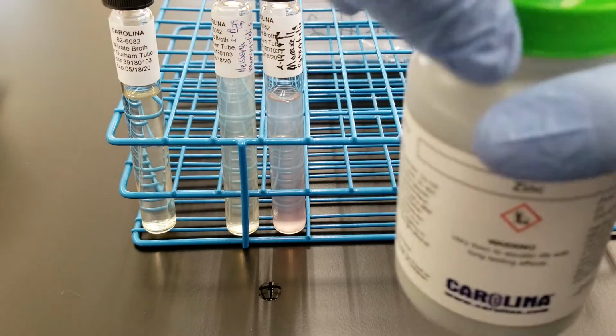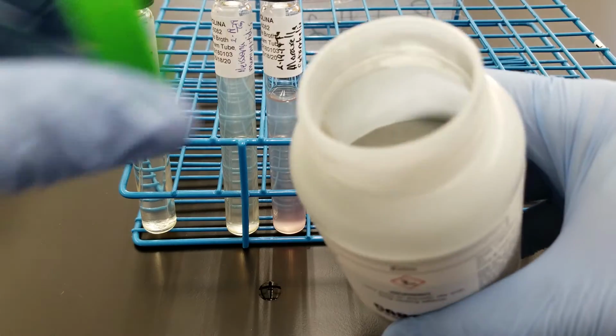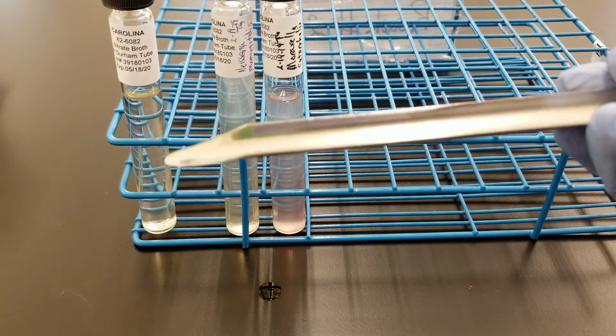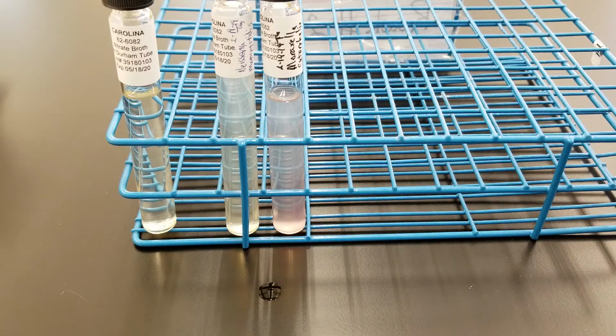Okay, and it does look like metallic dust. So don't leave it open or inhale it or breathe it in or anything like that. You'll end up getting it up your nose. So what we're going to do is we're going to use this little clean spatula guy. You can also use a stick.